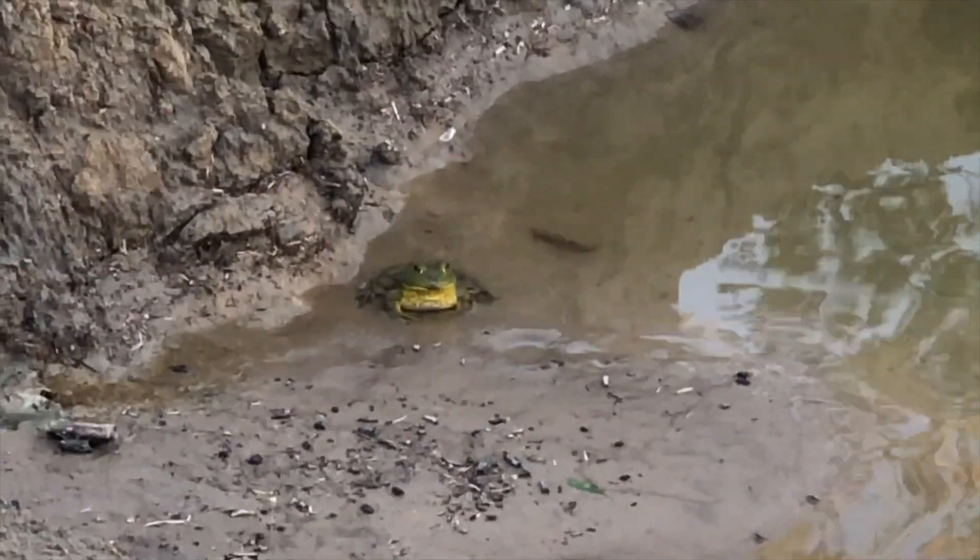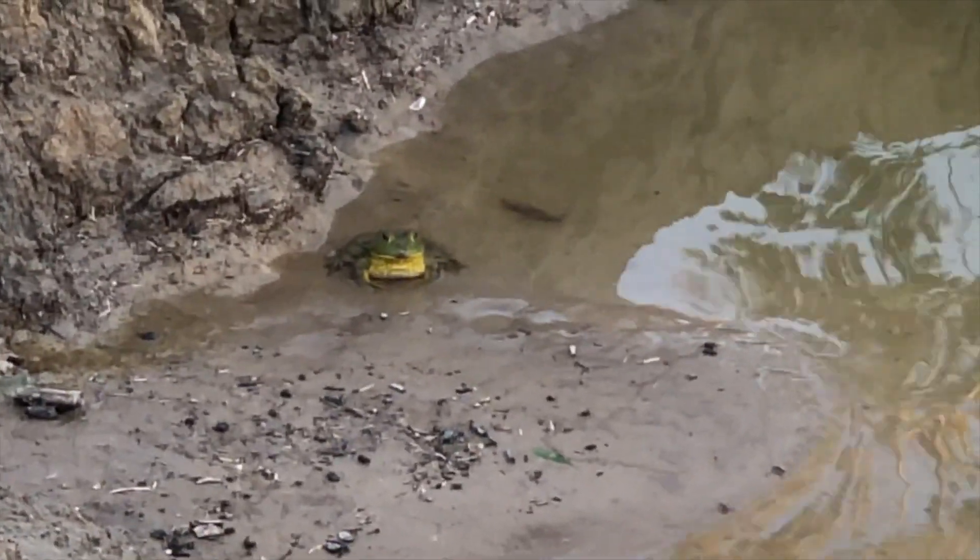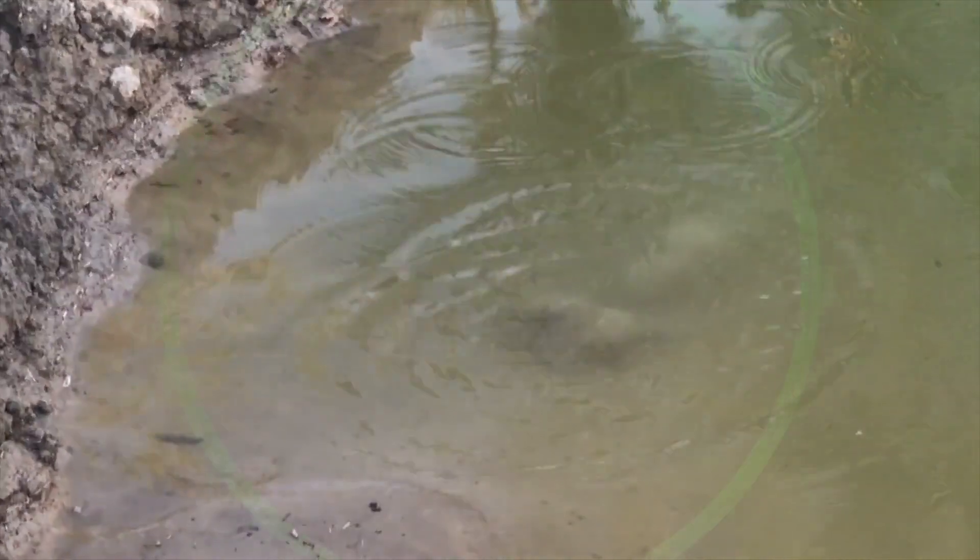Hey, welcome back. In this video, we're going to cover our first pond water pH test and show you what happens when you put fresh green oak wood in water. I was shocked.